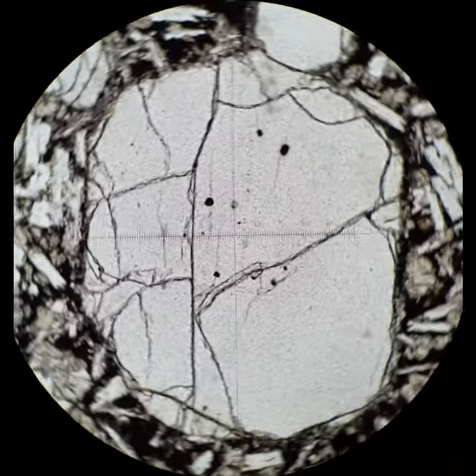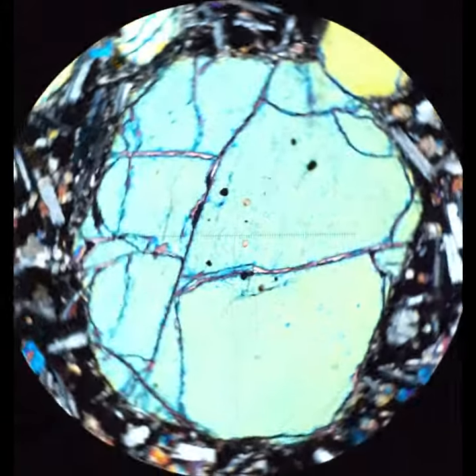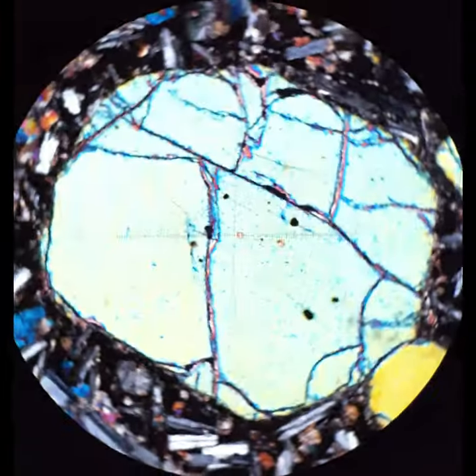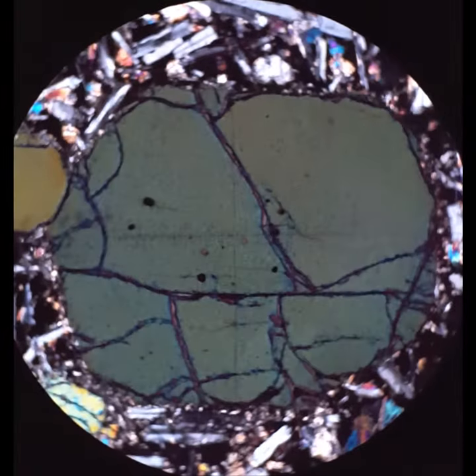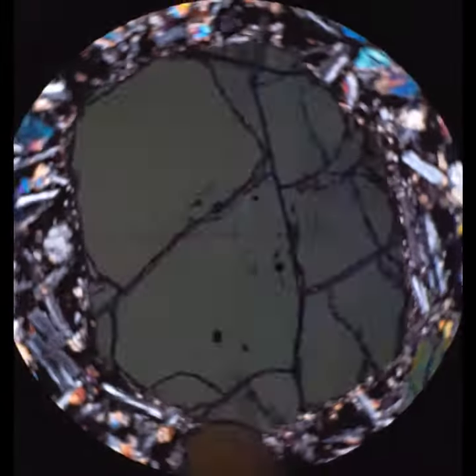When I cross the polars, you'll see that this has approximately... you've got to get it in just the right orientation, but it has parallel extinction. And fairly high-order interference colors. Much higher than, say, an orthopyroxene.